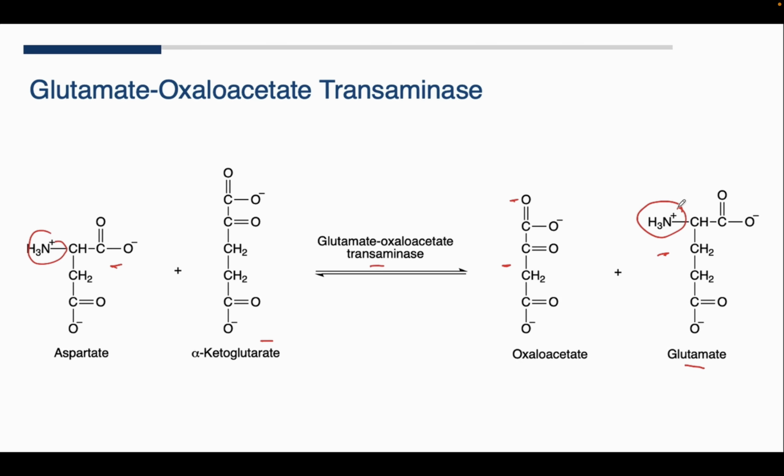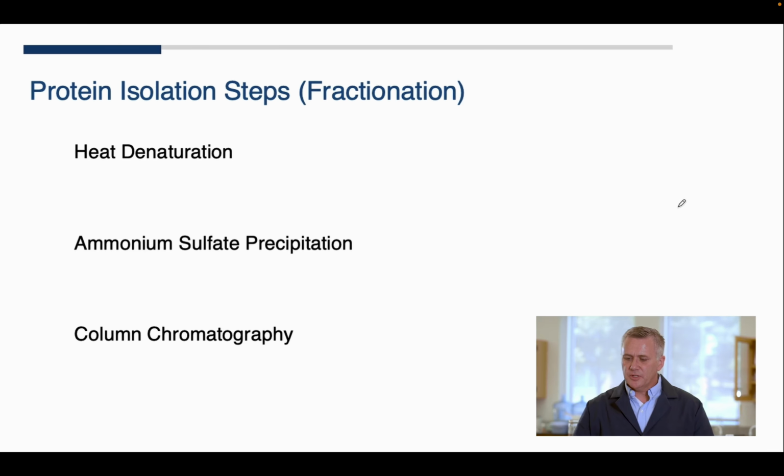And that's why we typically like things that are colored or can be observed in the ultraviolet range, or some range where we can detect it with an instrument. This reaction itself is not so easy to do. All right, so we're going to tell you about an assay to detect that in just a second. So that's really what GOT does and why it's important in general.